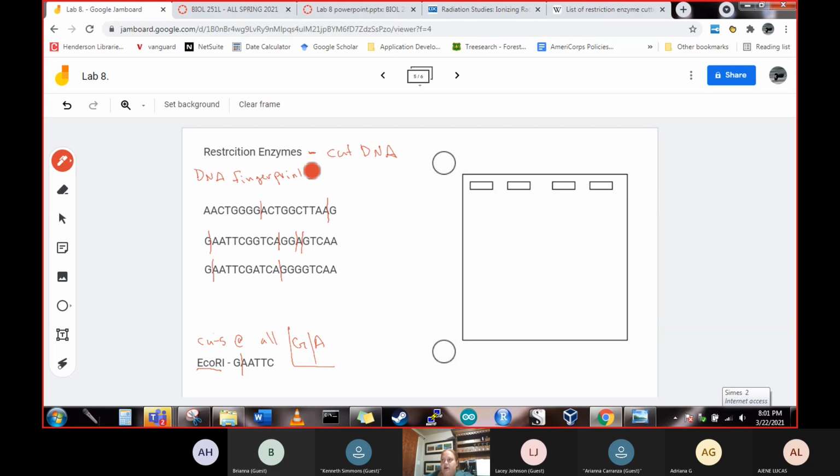If you're watching Forensic Files or Snapped or NCIS, all sorts of shows where they're doing forensics, they usually show pictures of these DNA fingerprints, little lines, and then they compare the two. They do paternity testing where you can see who's the father, or different things like that. DNA fingerprints are really commonly used for identification of plant strains, of humans, all sorts of things.